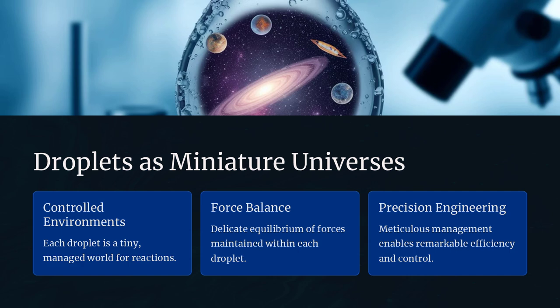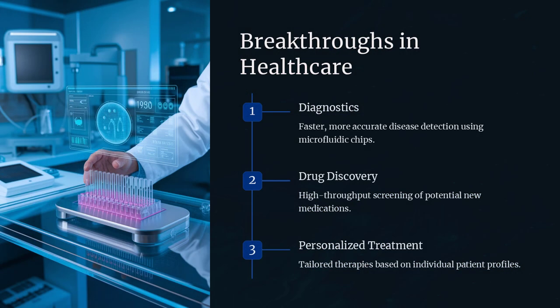Engineering the microfluidic channels themselves is an intricate process that blends advanced fabrication techniques with a deep understanding of fluid dynamics and material science. Using cutting-edge methods such as 3D printing, engineers can create channels with complex geometries tailored to optimize droplet formation and movement.